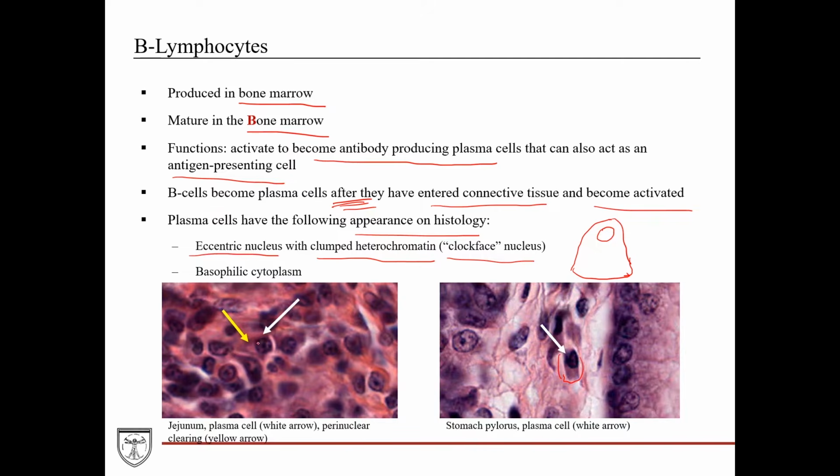You can see that really well here. You can see it's almost like you have the numbers outside here on a clock face. And again, see how you kind of see the cytoplasm fanning out like this. What's nice in this section is this yellow arrow is pointing to this. See this kind of fainter staining portion right here? This is pointing to the perinuclear clearing, which is actually where the Golgi would be located. So that's just a nice bonus finding here on this section.